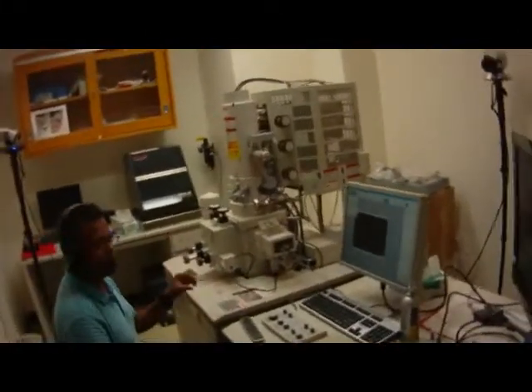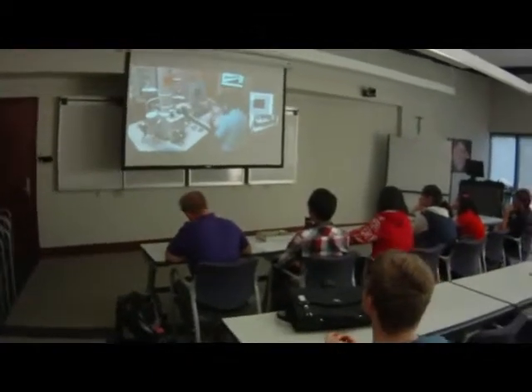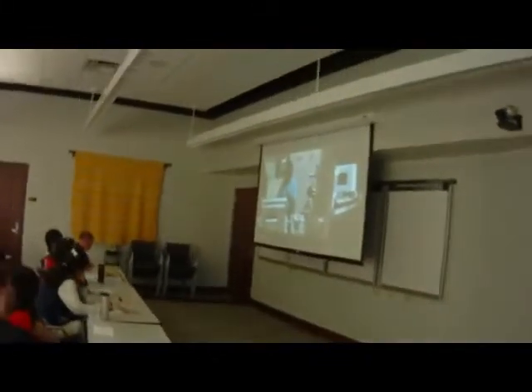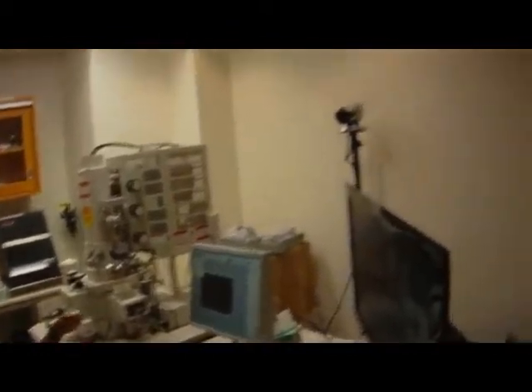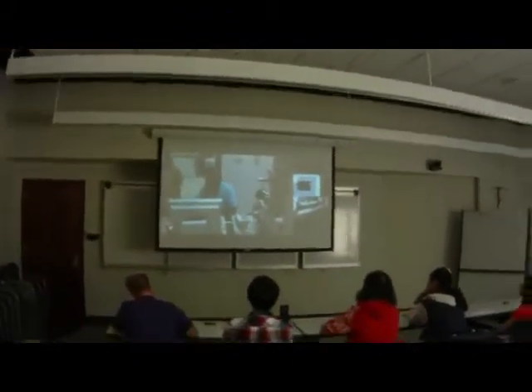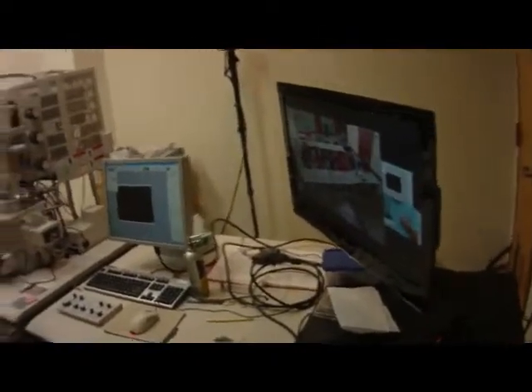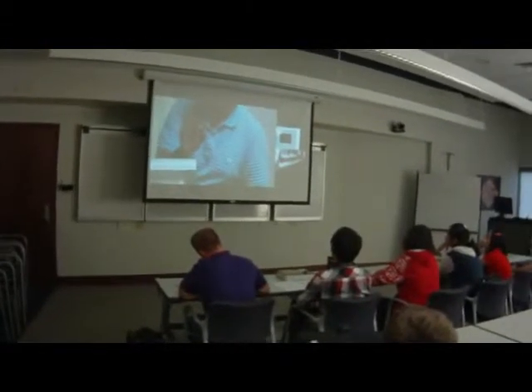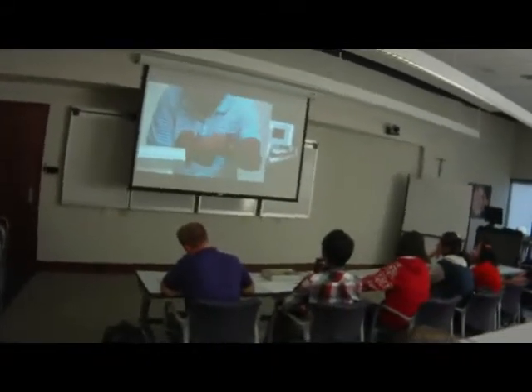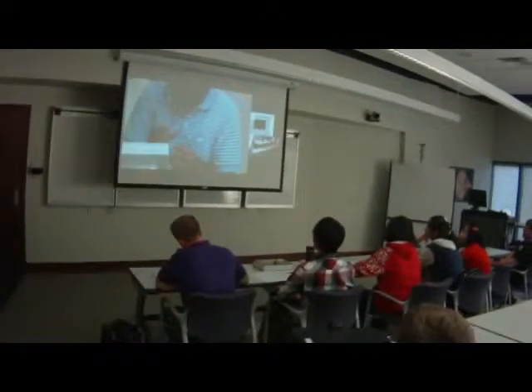Another requirement for the electron microscope is the sample that you're looking at. I'm going to cleave it and watch the width, pitch, and length of various dimensions of the groove. The sample goes on a carbon tape and this metal piece is what's going to hold it. It's actually a pizza slice out of a three inch wafer. Here is the piece — I want to look at it from this side into the face, so I've got to make a clean cut.